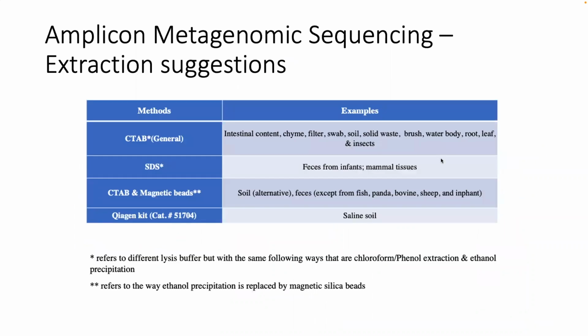So just again, for your reference, some ideal extraction methods for metagenomics. In general, in my opinion, you don't have to be as neat with DNA as you do with RNA. So these extractions can be a bit messy, if you will. You can put a lot of stuff into these columns and you'll still get community DNA. Whereas you may need to be salinity controlled, temperature controlled for specific RNA from different environments to elute out of a column. So these are some examples of known extractions: CTAB, magnetic beads, pretty common.